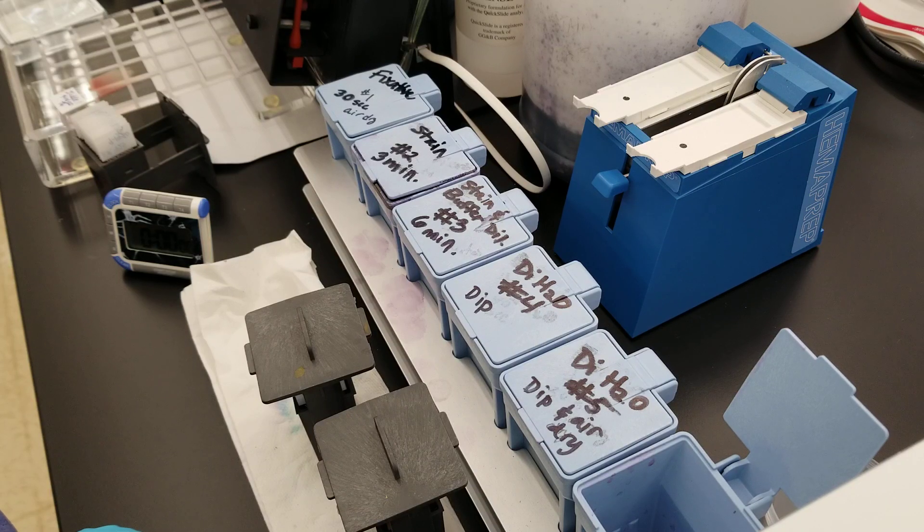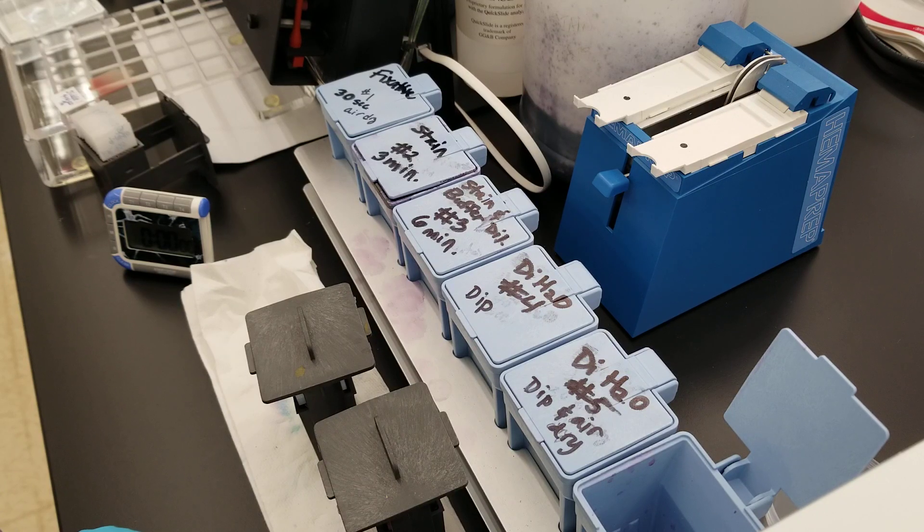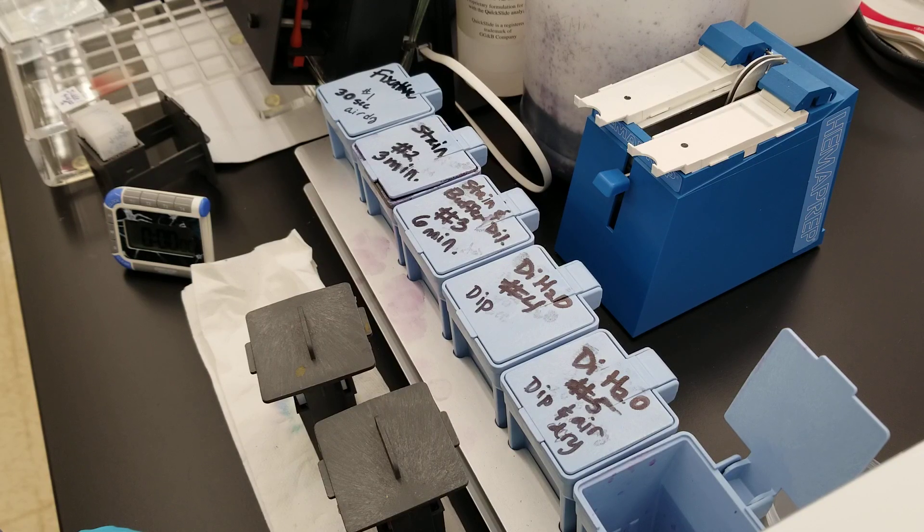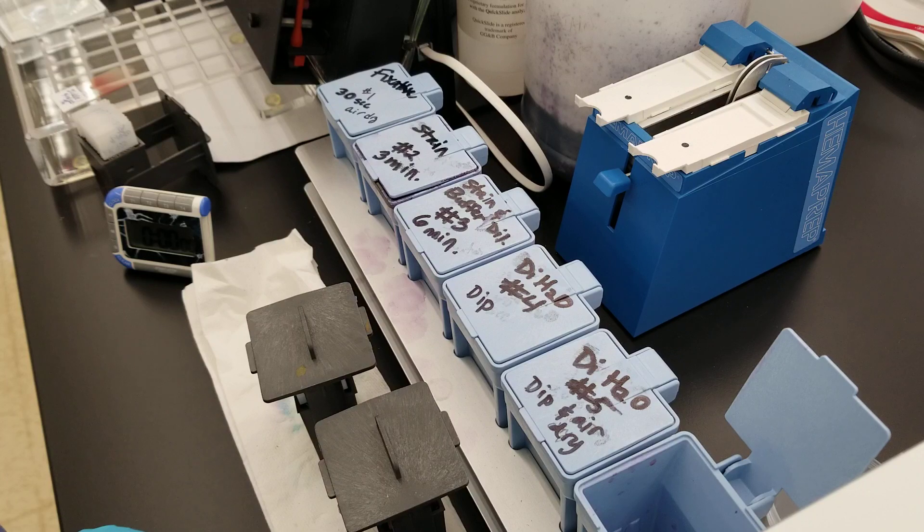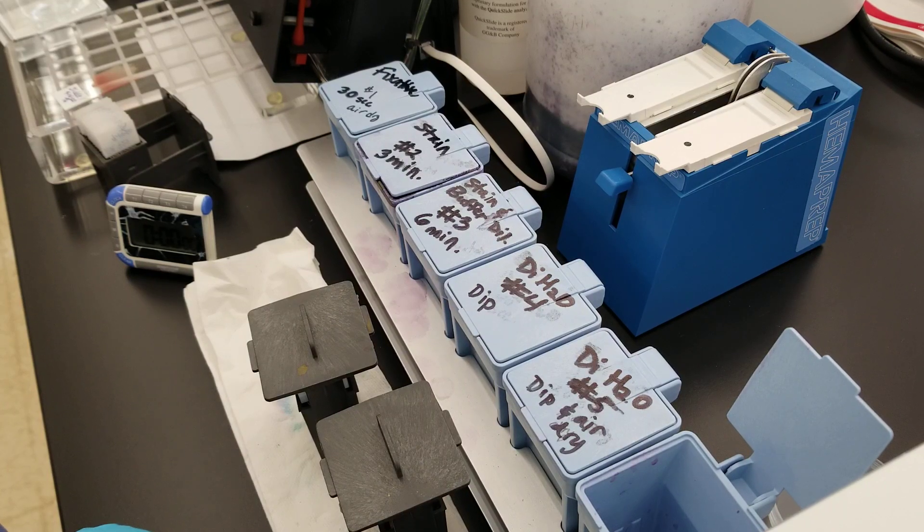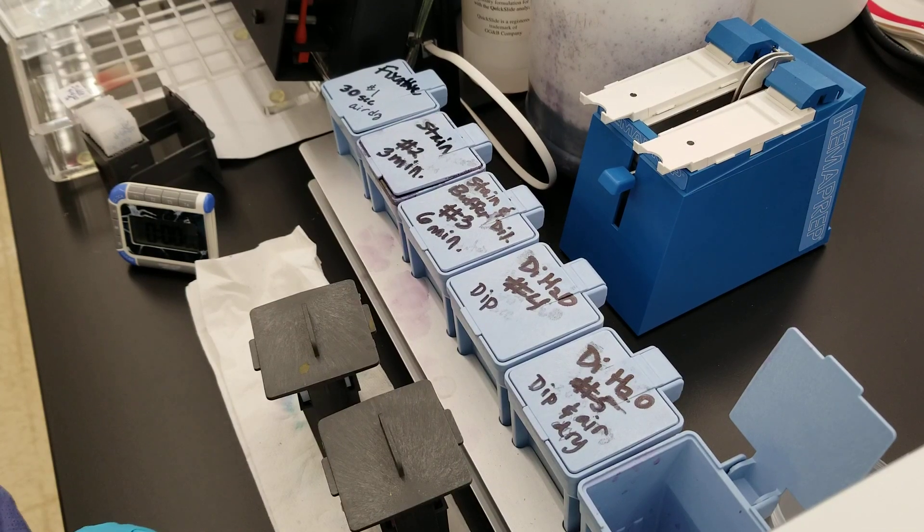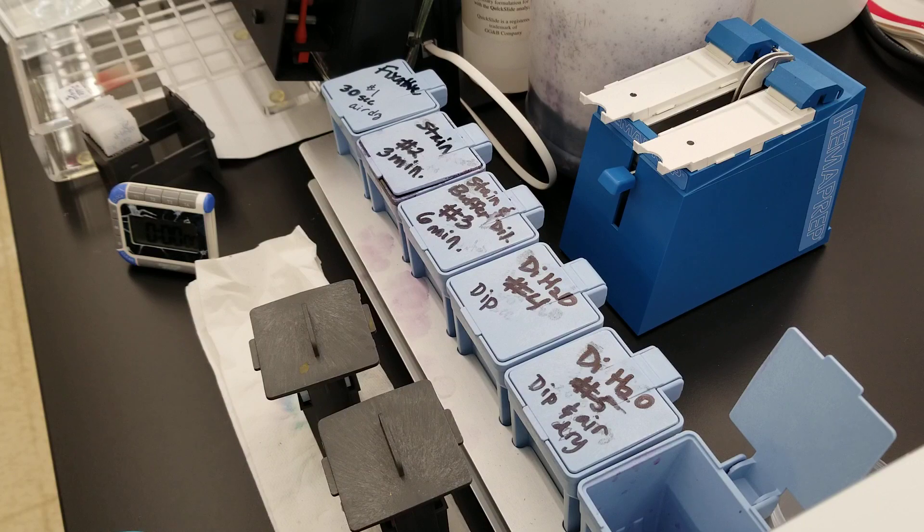Wright-Giemsa stain is a Romanowsky stain for peripheral blood and bone marrow smears. The most important parts of these stains are that you're using an oxidized methylene blue, azur B, and eosin Y stain. The methylene blue and azur B stains will stain the nucleus a shade of blue to purple, so you can use them to differentiate and make a diff smear and perform a white blood cell diff. The eosin Y dye is used to stain the cytoplasm of the cells an orange to pink color.